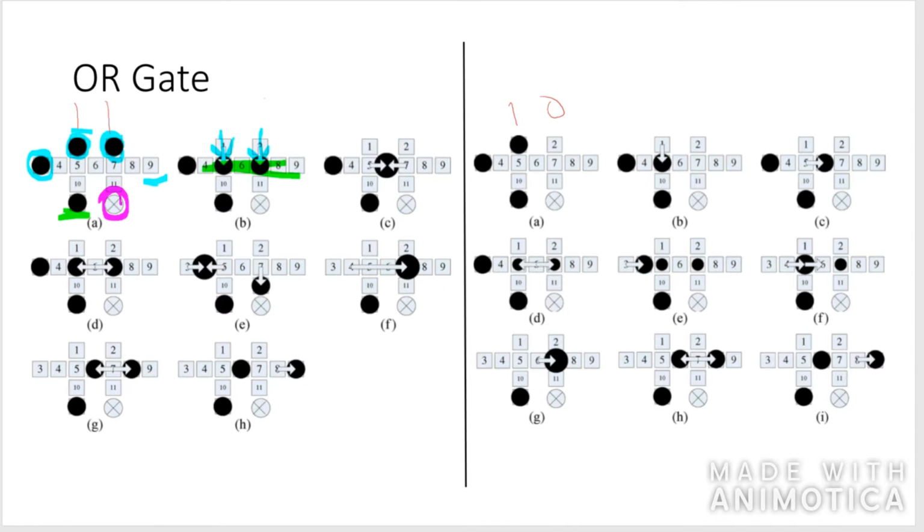So back to the microfluidic channels. In this step, the droplets are diverted into the processing channel. Droplets are merged together, and then the droplets are split. And now in this step, the volume of the split droplets, in this case, they're both 1x. And for the next step, a volume of 1x is needed for only one of the droplets.